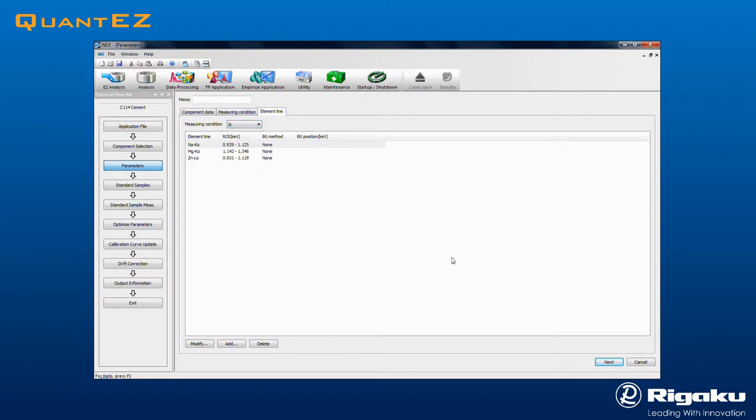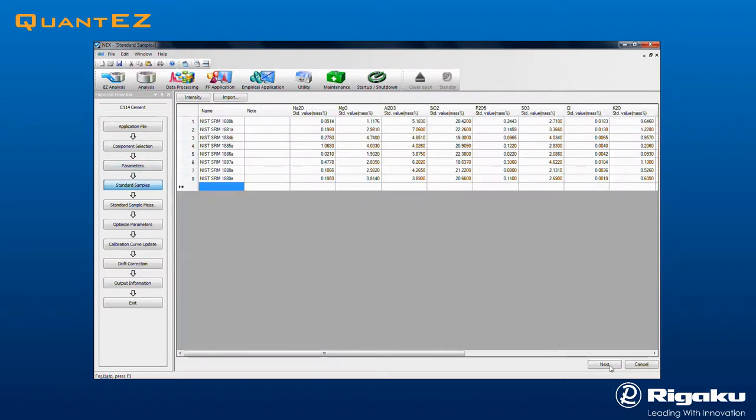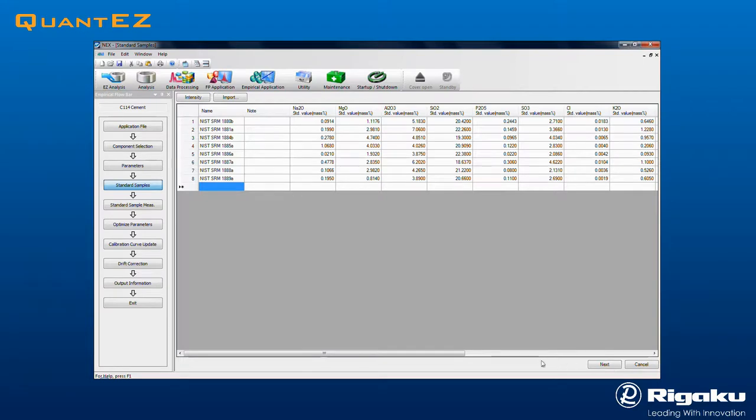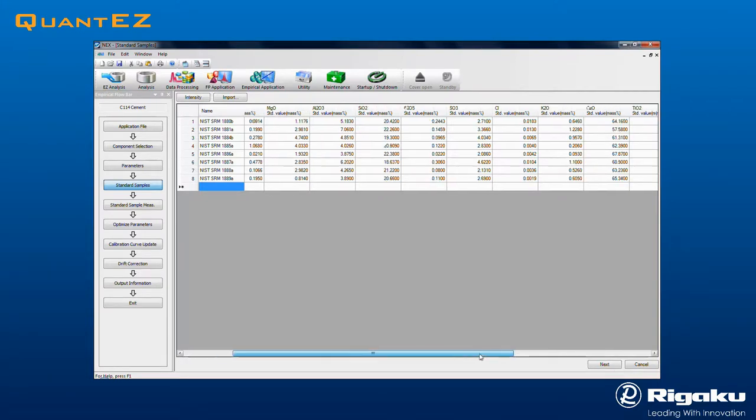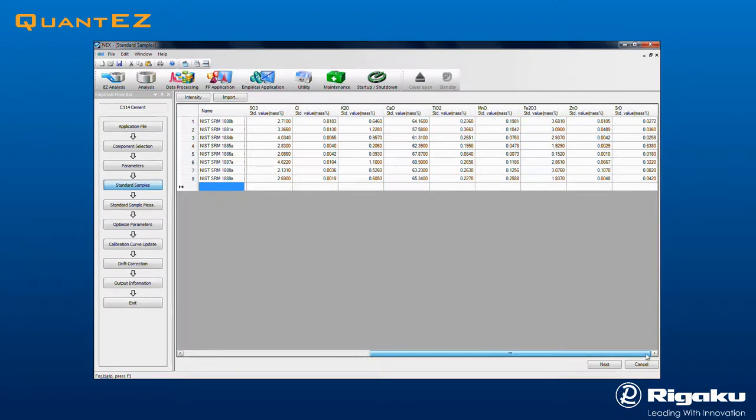Clicking Next brings up the Standard Samples table, which operates much like a spreadsheet. Enter each calibration standard and associated assay values. In this example, the NIST set of Portland Cement Standards is shown.